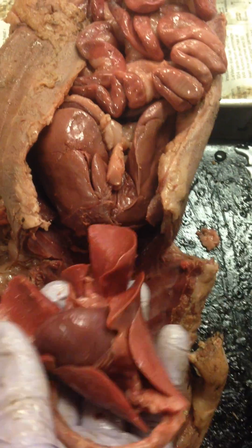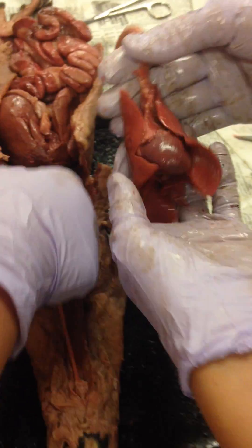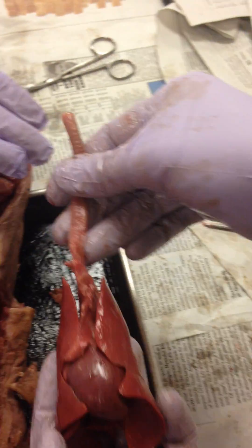So now I can remove my respiratory system and part of my circulatory system. Obviously I didn't remove the mouth so I don't have the whole respiratory system, but I've got a good piece there. Alright, thank you surgeon.